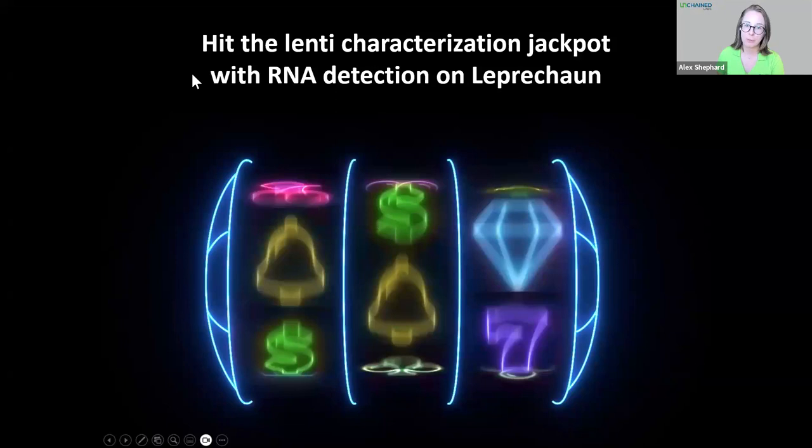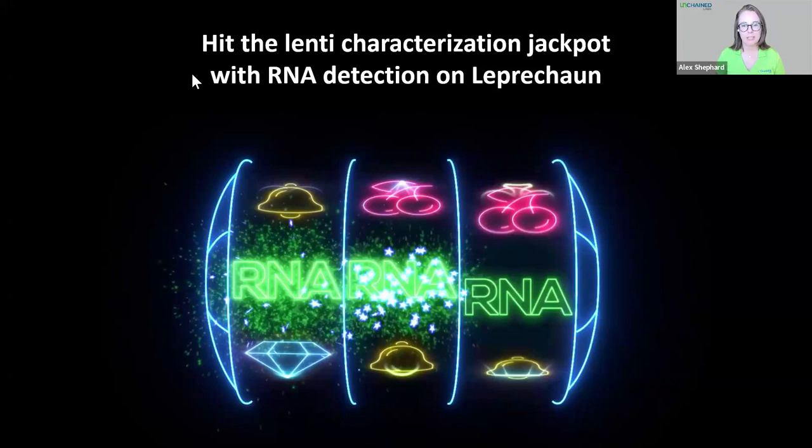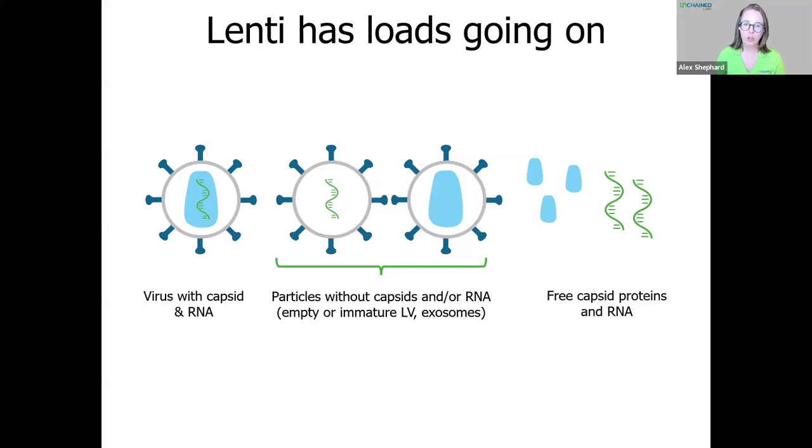In comparison to some other viruses used for cell and gene therapy manufacture, lentiviruses are incredibly structurally complex, in part due to the presence of both a lipid membrane and a protein capsid, which encase the RNA genome. And this structural complexity means that there can be lots of other particulates present in your lenti samples, such as free capsid, membrane fragments, and immature virus, alongside your intact virus. This means that getting an accurate titer, which is unaffected by these contaminants, can be a real challenge with current analytical techniques.